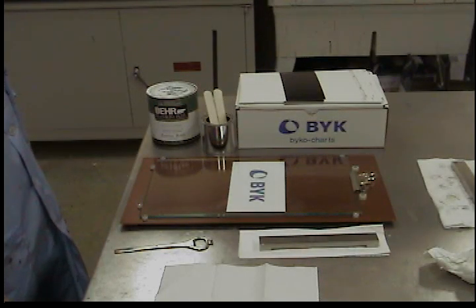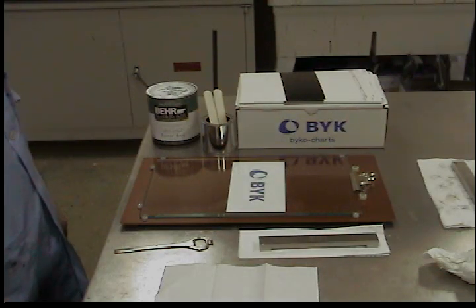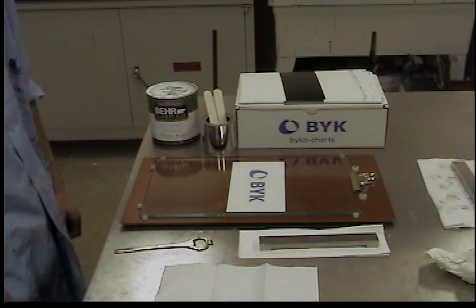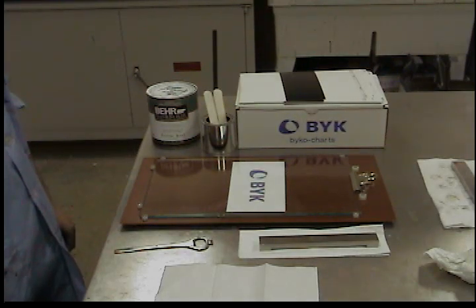Manual Drawdown Procedure. The only meaningful way to compare two different batches of paint is to have a dry film of uniform thickness and texture. Bar type applicators which apply a wet film of 3 mils or less are used to determine hide or contrast ratio. Applicators which apply 4 mils or greater are used to accurately measure color and gloss.